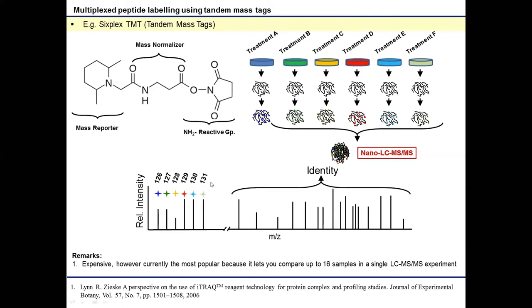And it gives you an advantage because in the identity of the peptide sequence, you actually get a gain in signal to noise. So when you have something that's present in all the samples, which might be important for whatever biological question you're answering, it allows us to boost the signal to noise so that you get very clean data on that side, in addition to the quantitation.